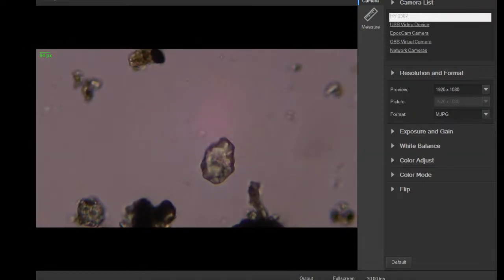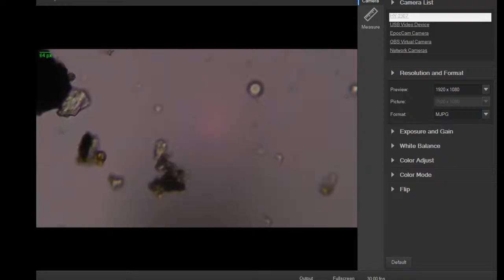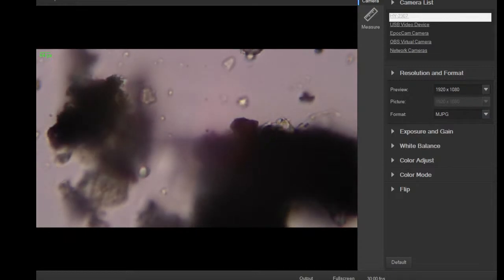So you can see why it's very useful when you clean your hands with it or clean a surface with it. Kills everything in contact. Even nematodes, which are pretty tough. I mean, there are nematodes that live in vinegar called vinegar eels, and that's a pretty harsh environment. Yet the isopropanol just cuts right through the cuticle, the little covering that they have. They're not as tough as an Ascaris worm, which can actually live through a digestive system and stuff like that. But that looks like it could have been something, but probably not.